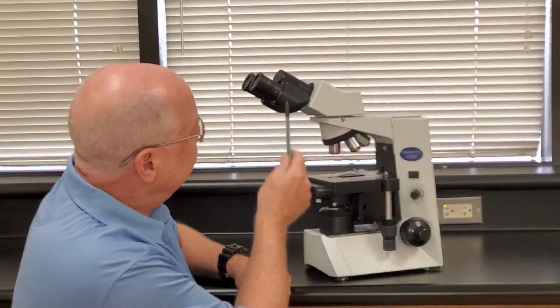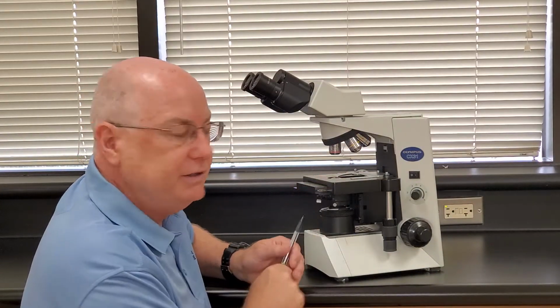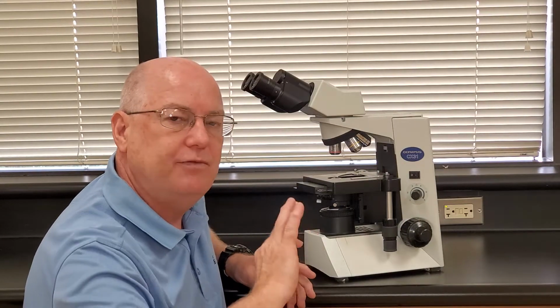You need to know which parts you're grabbing. So the anatomy of the microscope, or the parts of the microscope, will be on your first lab test. So make sure that you know them. We can point to one of these parts, like this little silver thing here, and say, please ID the structure or ID the microscope part, and you should know the name. I may not cover all of the names that are on the list of things to know, but I'm going to go over the ones that are important.